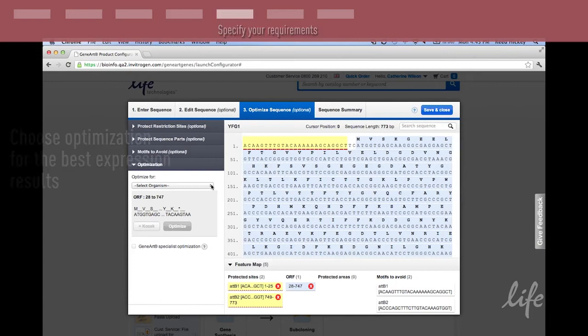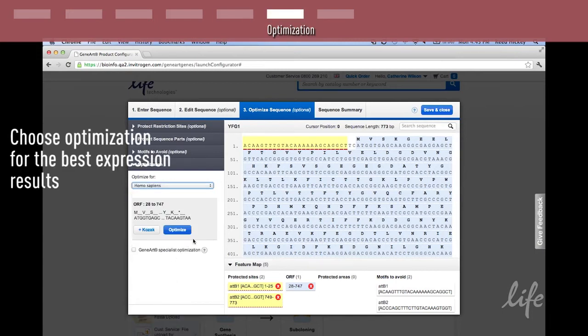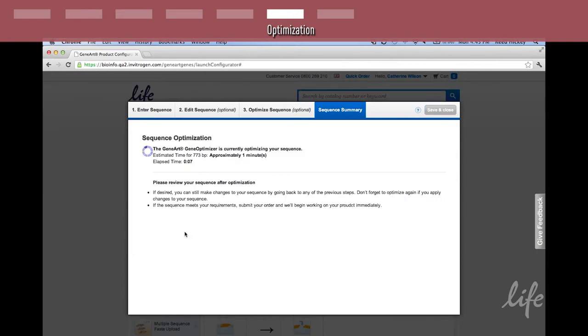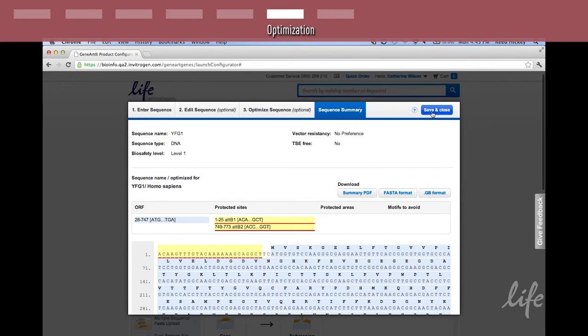In step 3, select optimization for the best expression. The optimization will occur in real time. When the optimization is complete, you'll receive a report on the optimization. Click finish and you're done ordering your gene.